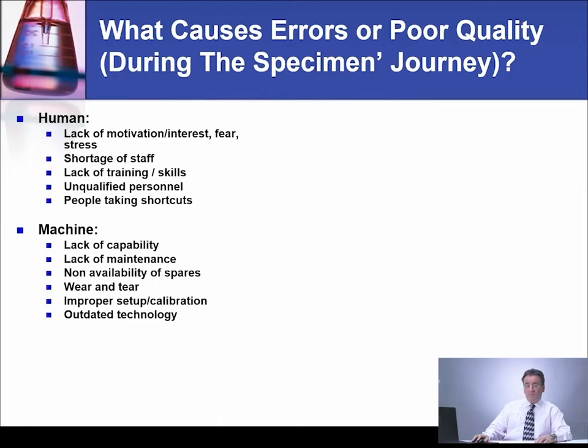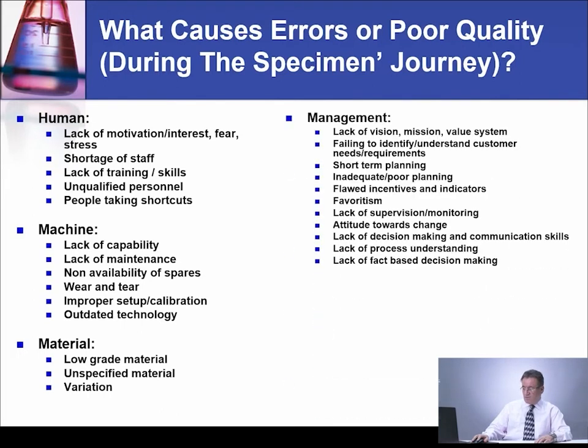It could be from the machine or the instrument: lack of capability, lack of maintenance, non-availability of spare parts, wear and tear on the instrument, improper setup calibration, outdated technology, all these things. It could be from the material: low-grade material, unspecified material, variation in the material.